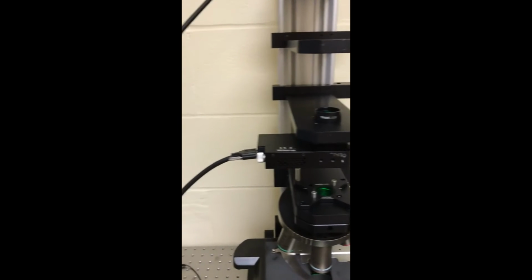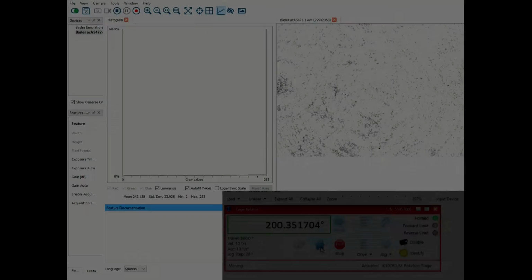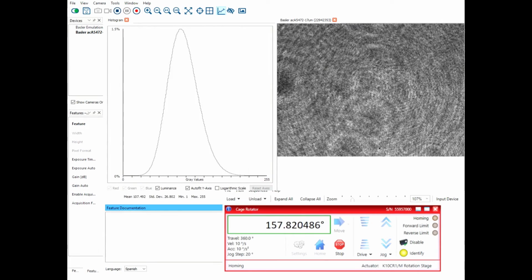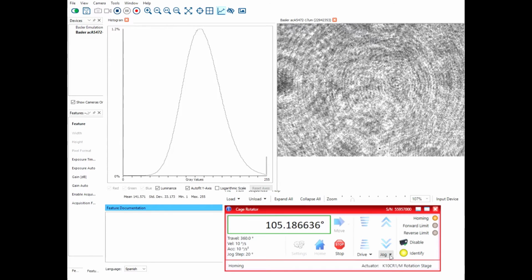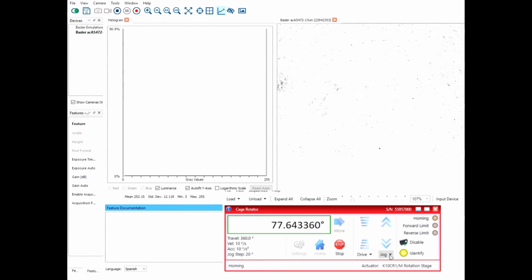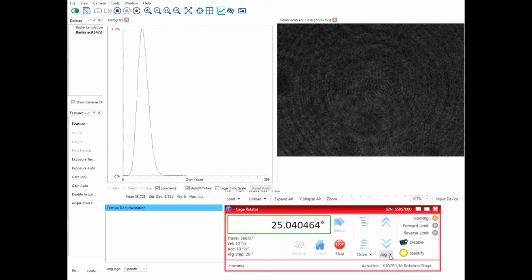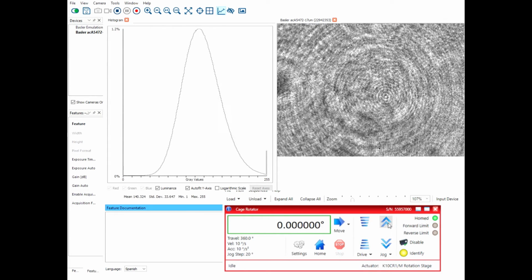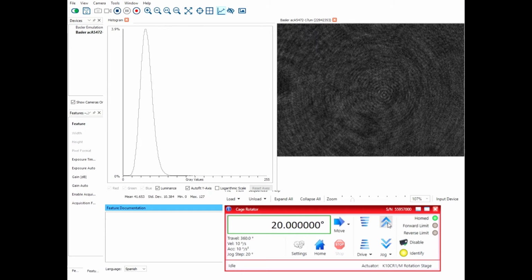The linear polarizer is mounted on a motorized mount to align precisely its transmission axis. Connect the motor to the computer to determine the orientation of its transmission axis. Now, rotate the orientation of the linear polarizer until we find the orientation in which the intensity reaching the sensor is minimum. At this orientation angle, the transmission axis of this linear polarizer is at 90 degrees with respect to the reference, which is the calibrated linear polarizer inserted after the polarizer.